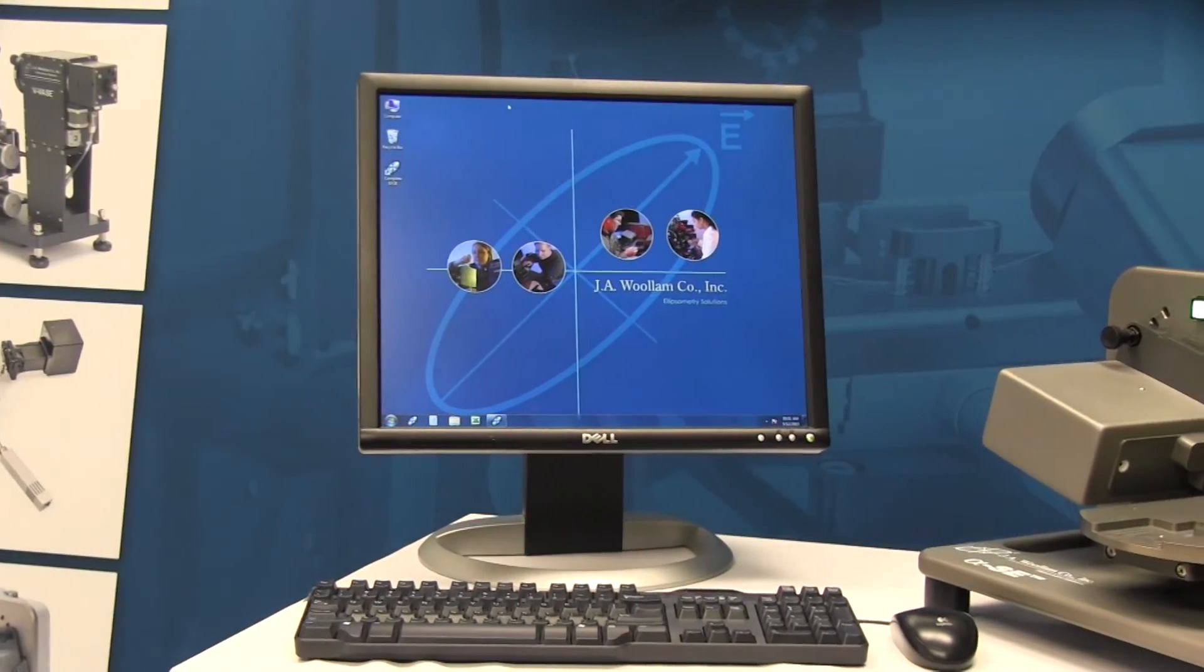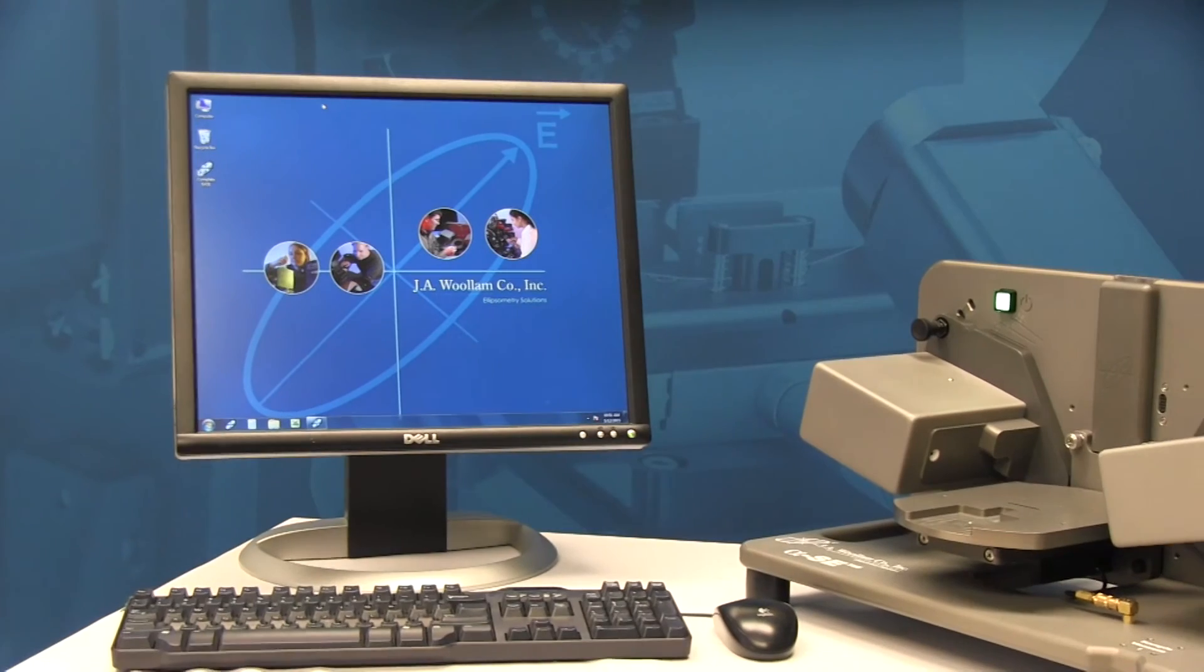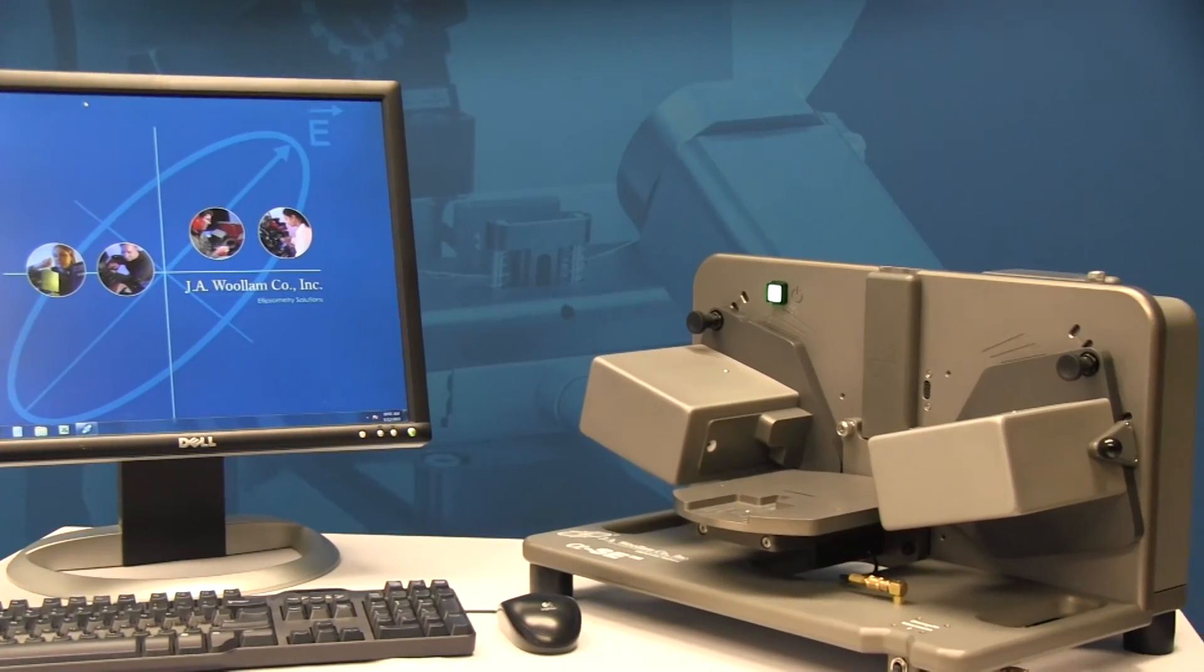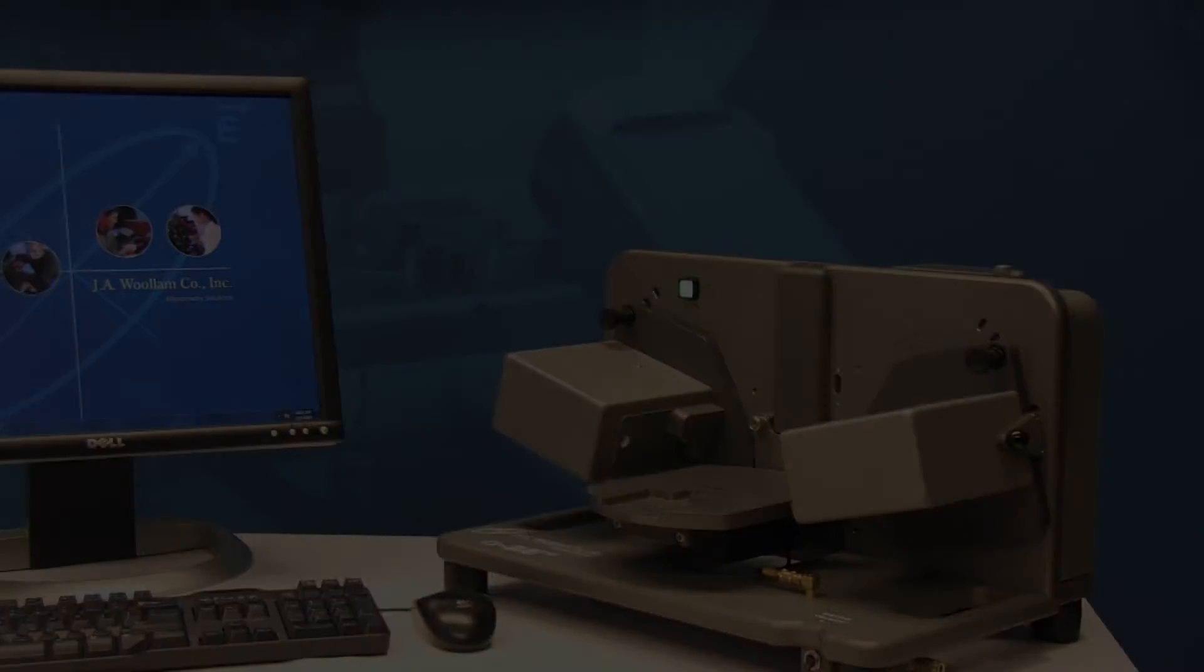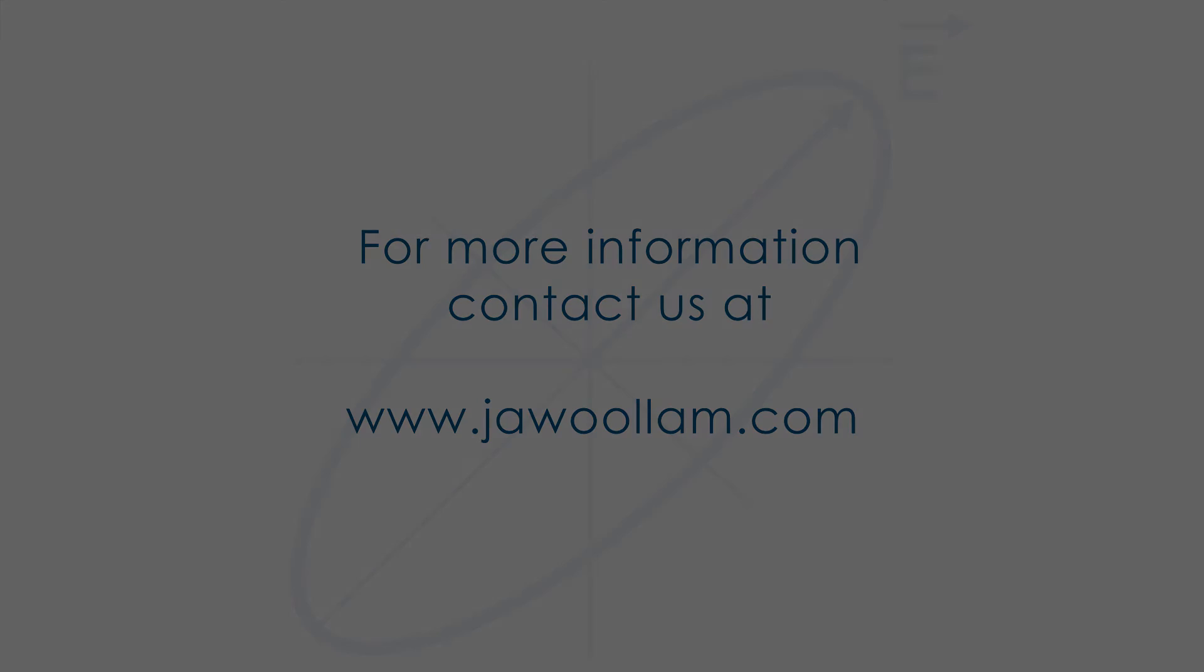The Alpha SE is an affordable solution for true spectroscopic measurement of your thin films.